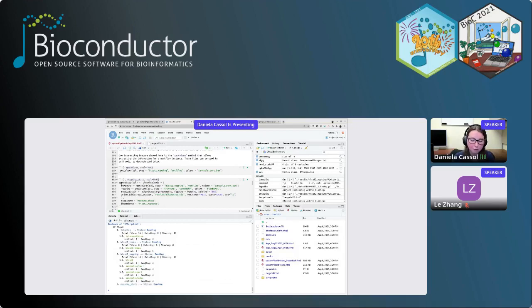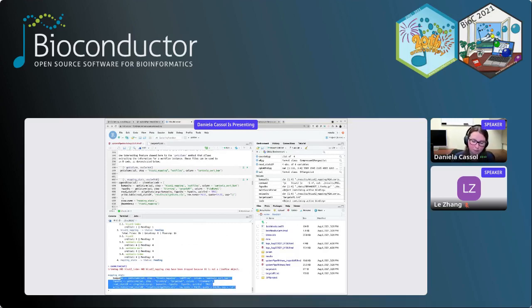How you can look and make sure everything is okay: we have a function called codeLine, and I'm going to print the whole object. This function will tell you the first 3 steps don't have any R code, so they are not line-wise objects, and then the 4th one is the mapping. Here you can see the exact code, so it's very easy to look and see if anything is wrong. Another detail: we haven't run this yet. This is just an expression, and we'll run it soon.